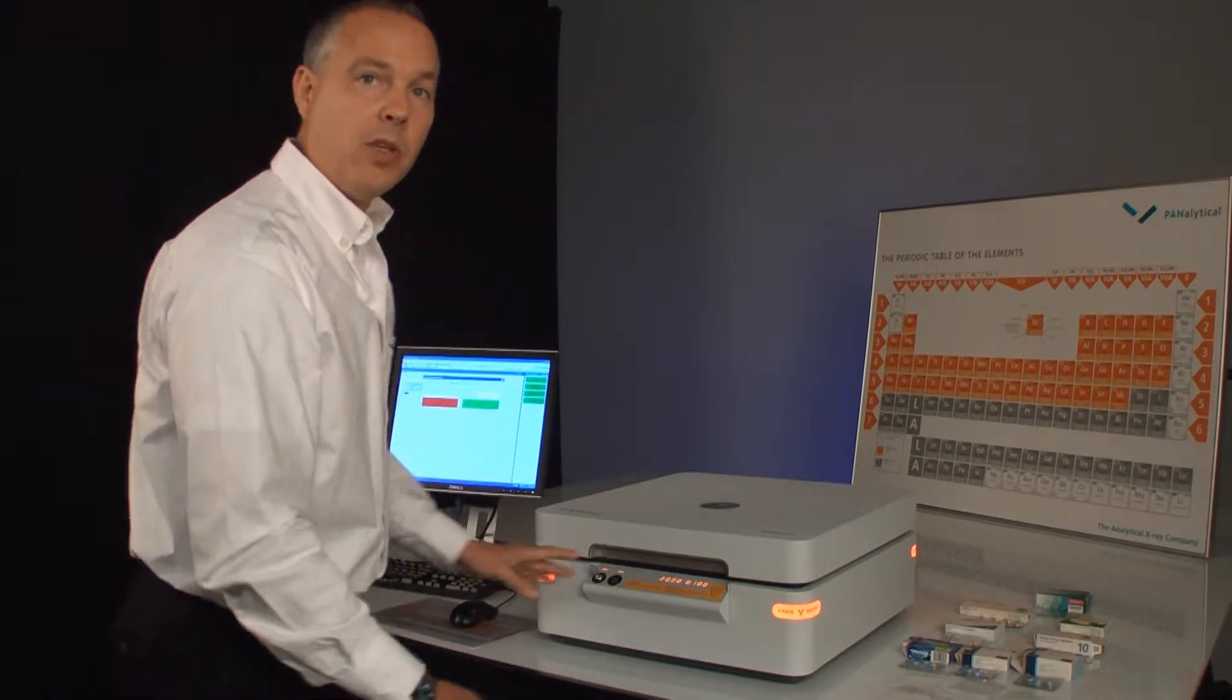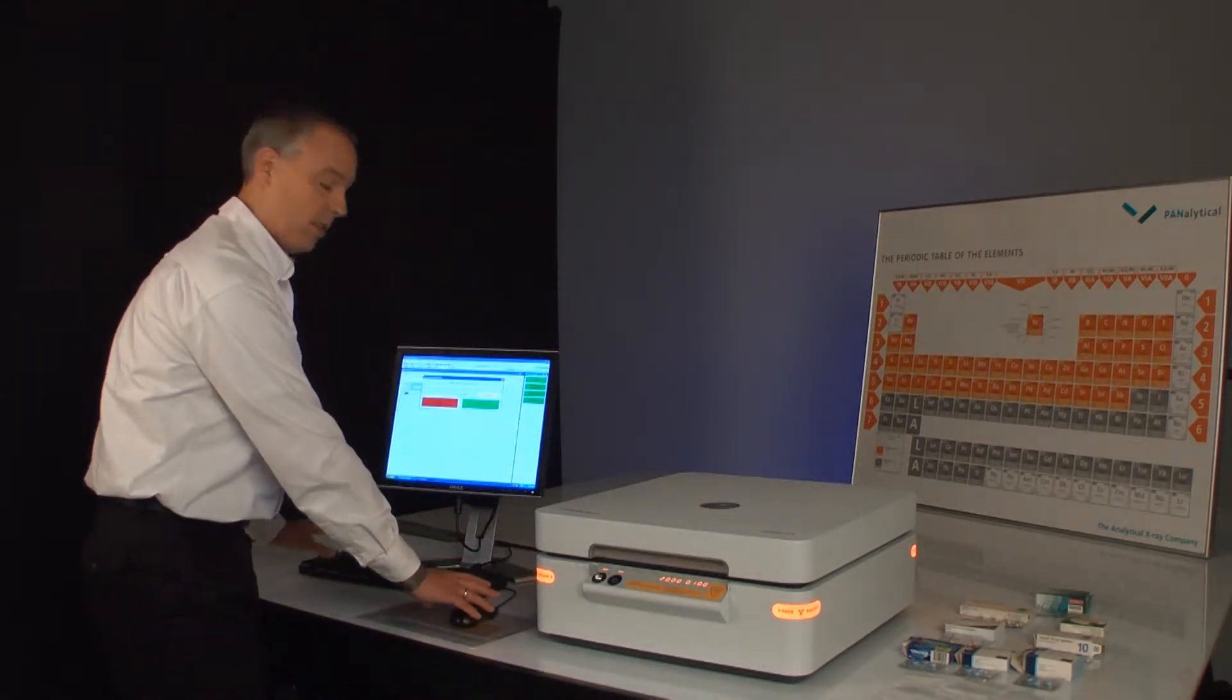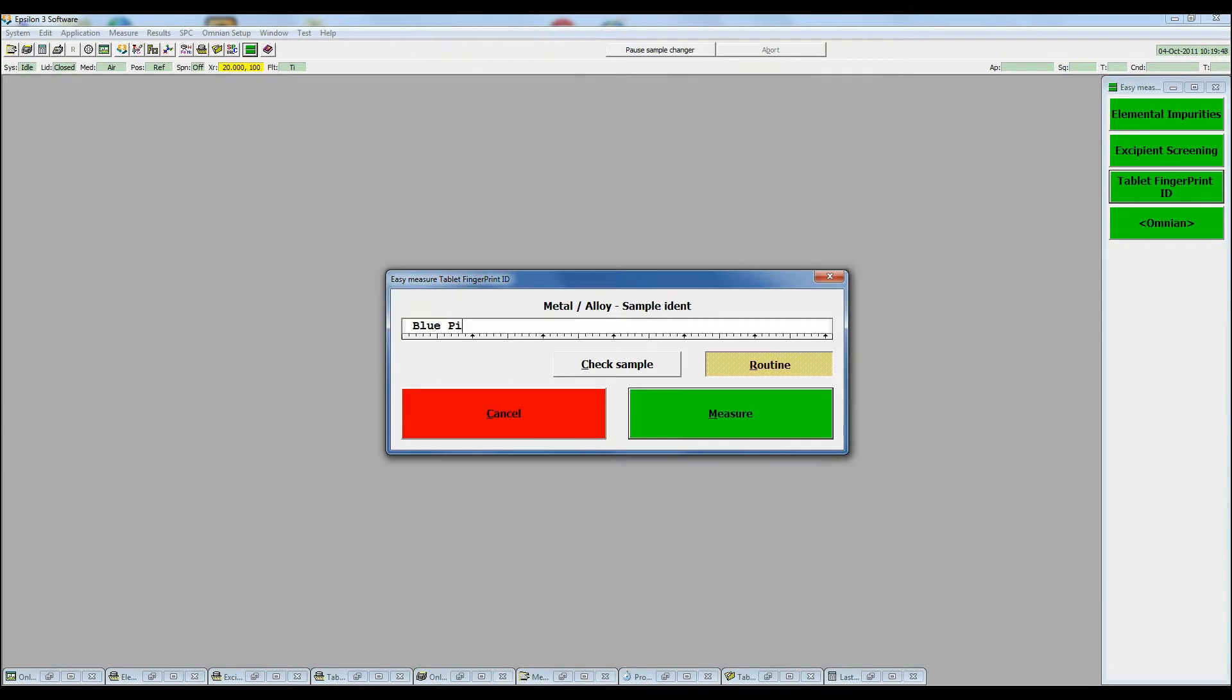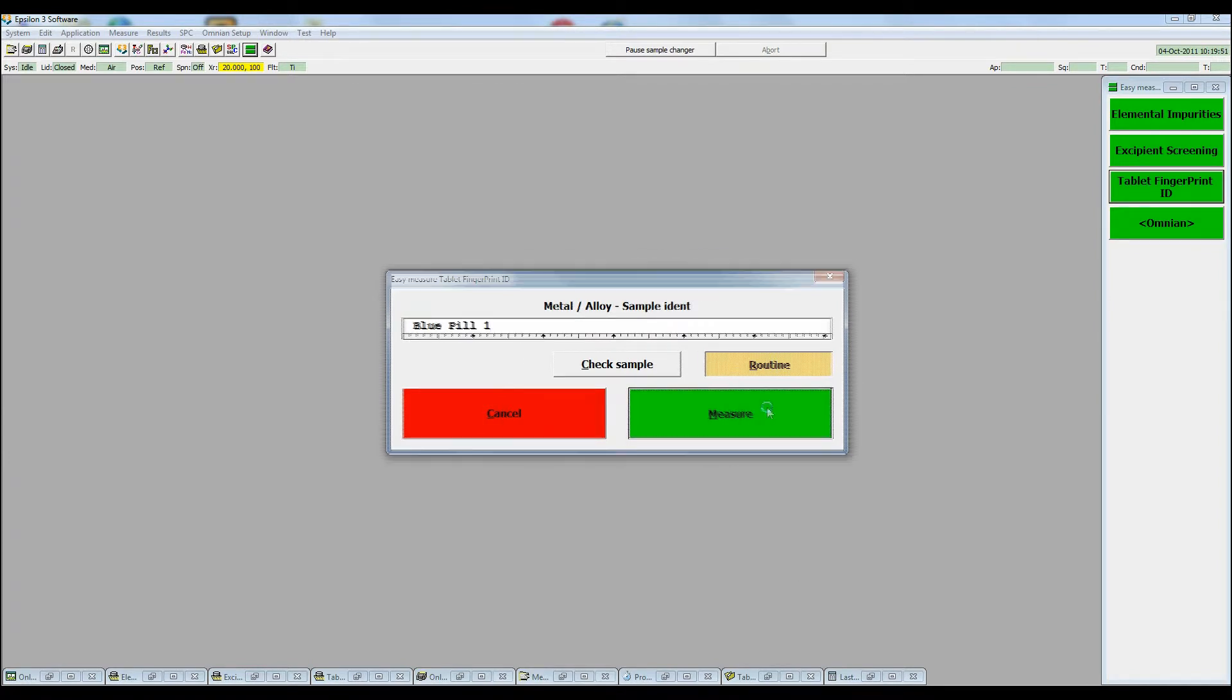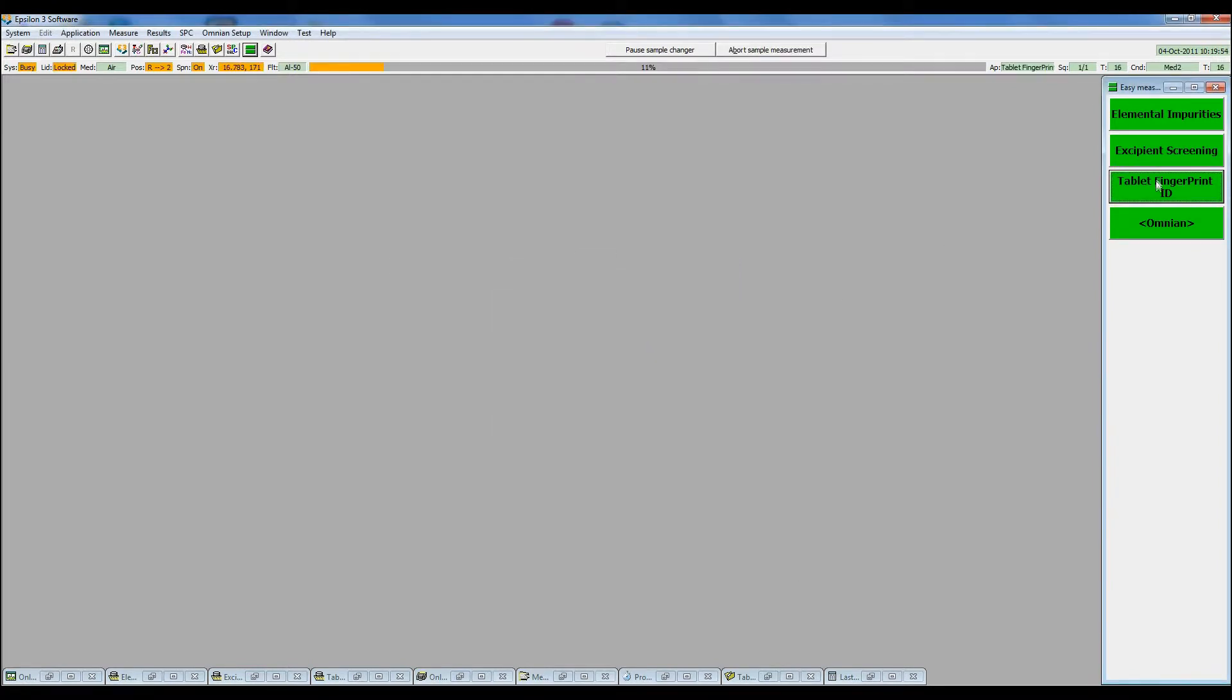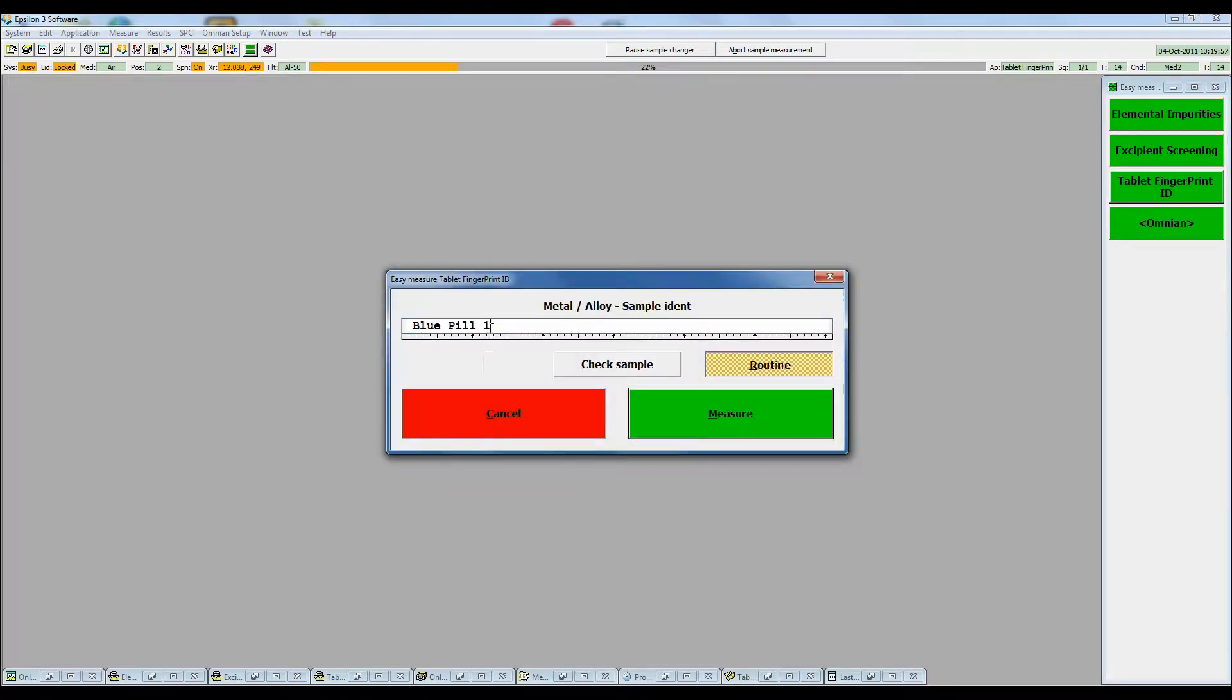Now all we need to do is type in a sample identity and click measure. We'll call the first sample from the blister blue pill 1, allocate its position, and our suspect pill, pill 2.